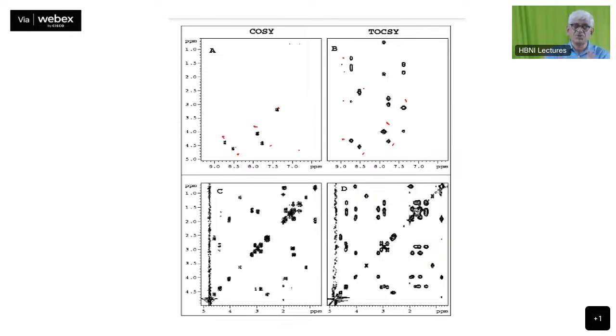There are several residues which finish by beta. And of course, serine is one of those. And there are several residues which finish by the beta only. There is nothing beyond that. Okay, and there are some which finish at the alpha itself. That is the glycines. The glycines finish at alpha. There will be nothing on the top if you have a glycine.